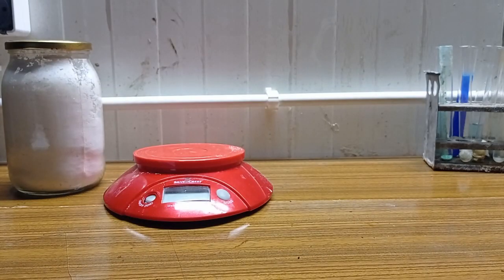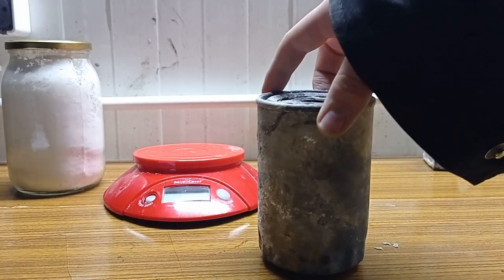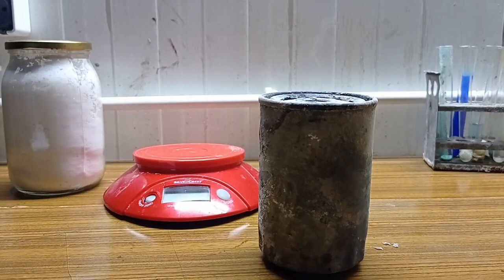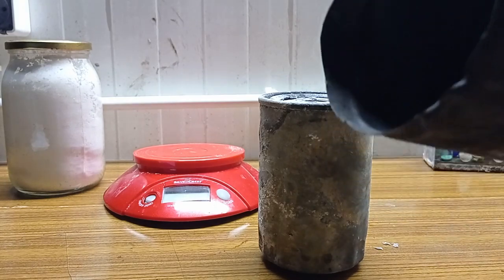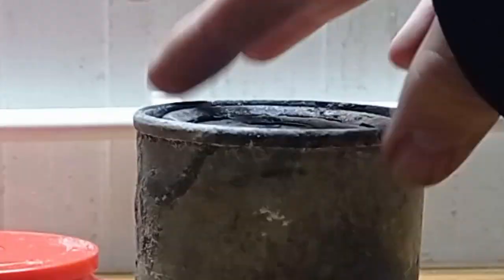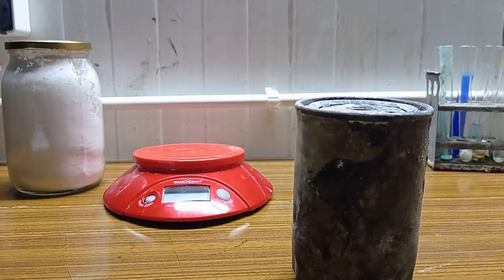In the furnace there are very high temperatures, so we need a good container which won't burn. I'm using a car oil filter — I just cut out this metal cup and it looks like that. I know it's so nasty. I'm gonna cut this filter too and then we can start.